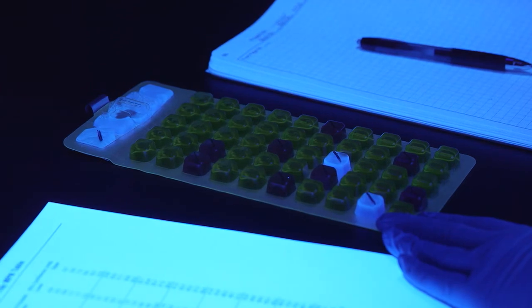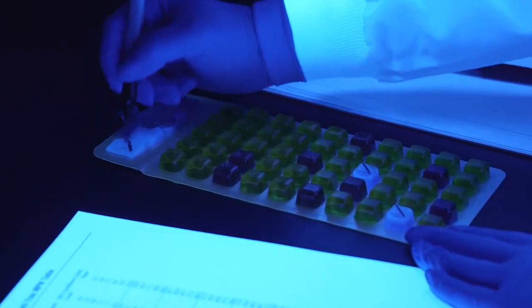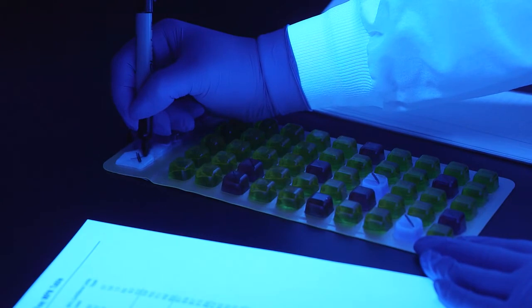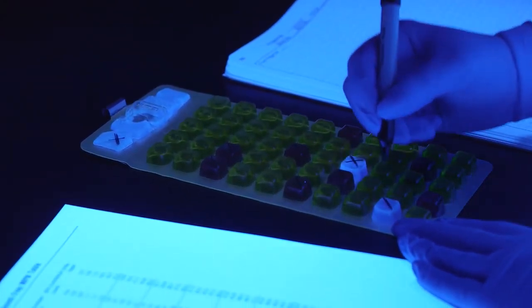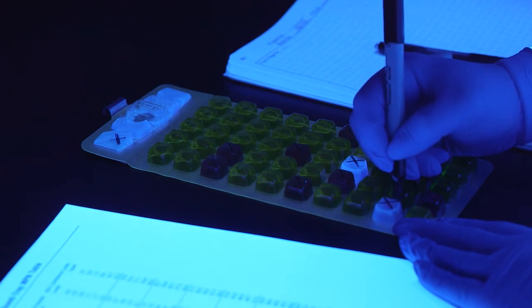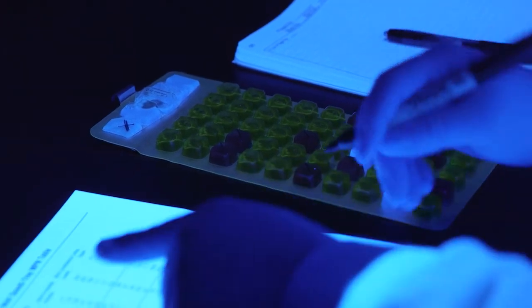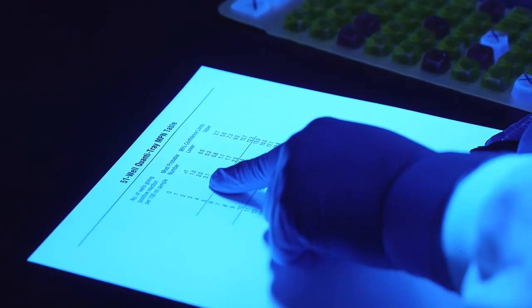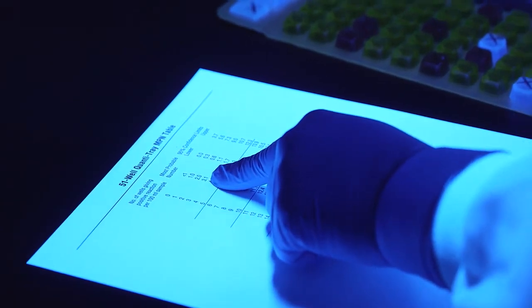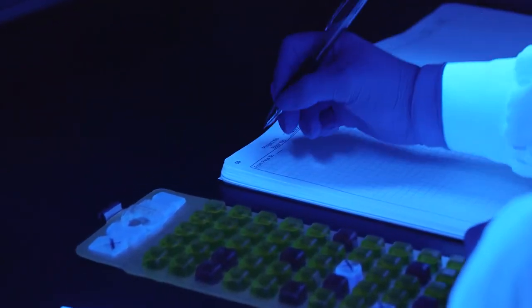To determine the number of E. coli, view the QuantaTray with a UV lamp in a dark environment, shining the light away from your eyes. Keep the light within 5 inches of the tray. Mark each fluorescent well with a permanent marker. Count the fluorescent wells, and then refer to the corresponding positive well line on the MPN table. The most probable number of E. coli for this example is 3.1 per 100 ml.